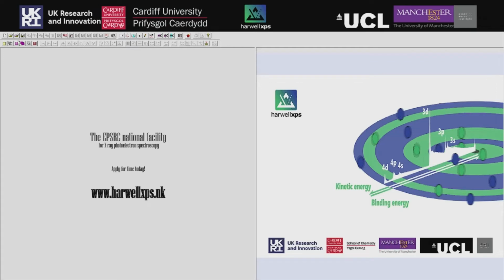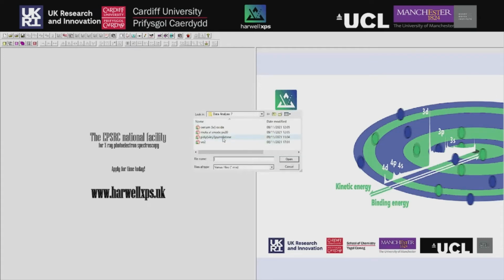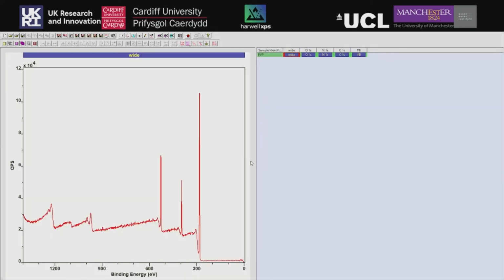And we're going to get started. So these files will be provided for you to play with afterwards as well. You can have a go at what we're doing in this session, and you'll also be able to have a go at a couple of other examples that we will provide for you. So do feel free to get in there, get stuck in and play with those.